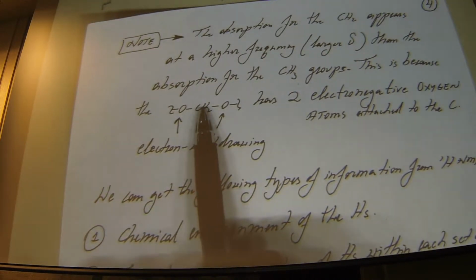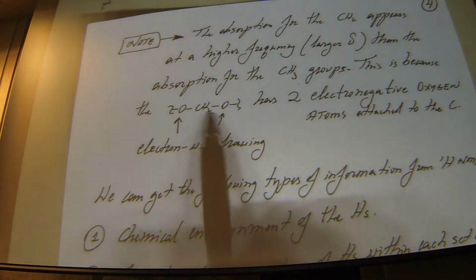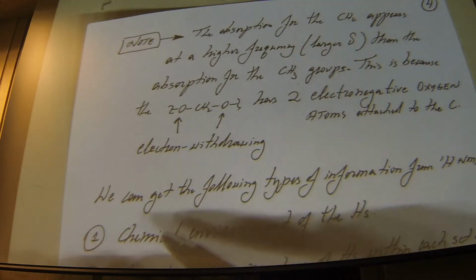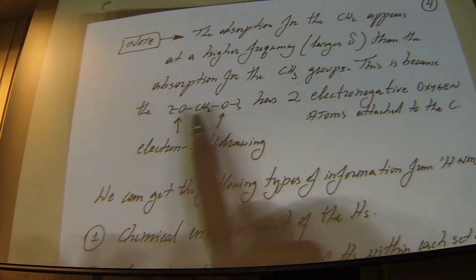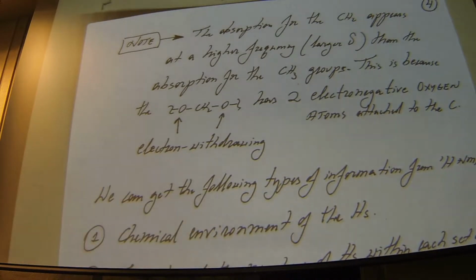It's going to give us a lot of information about the chemical environment of the protons that are responsible for that peak. The high frequency peak, the one to the left of the spectrum, was for the CH2. That CH2 group is flanked by 2 electron-withdrawing oxygen atoms. Remember that oxygen is electronegative with respect to carbon.